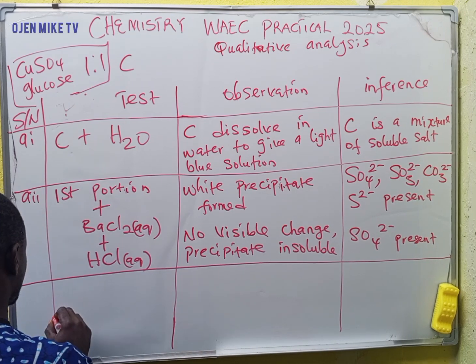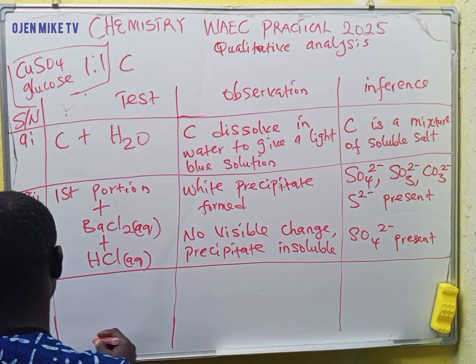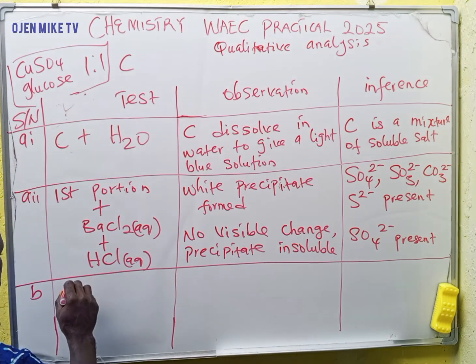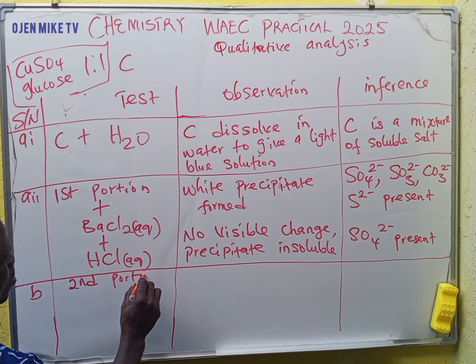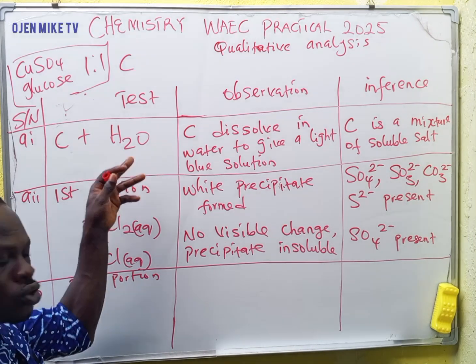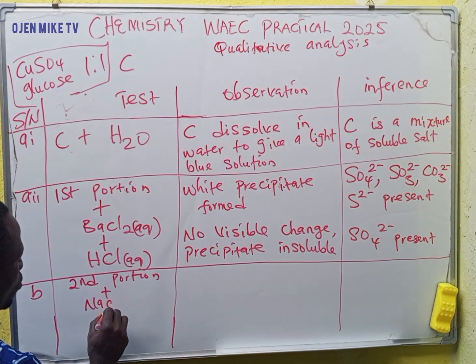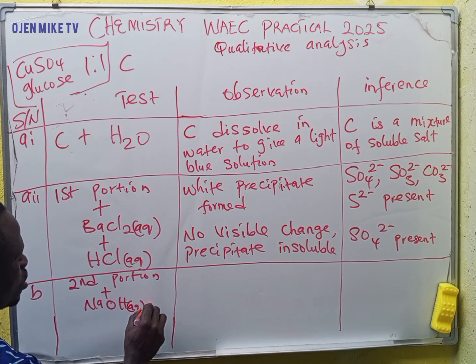The next thing we are going to look at is the second portion. Let's title this one B, second portion. We are done with the first portion. Second portion now. Second portion of this solution plus NaOH aqueous in drops.